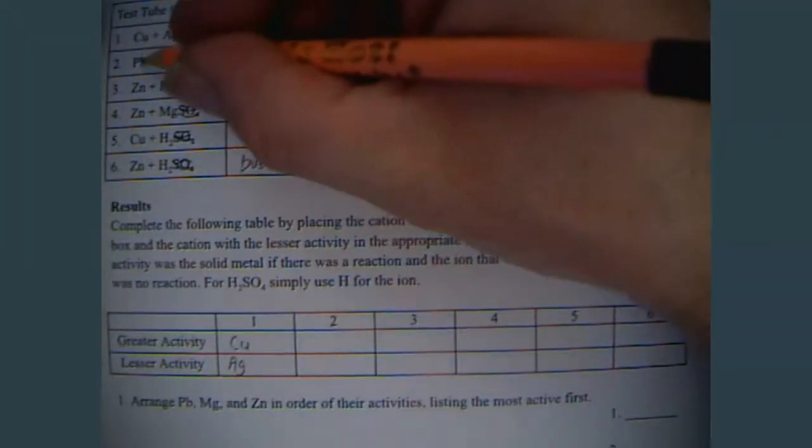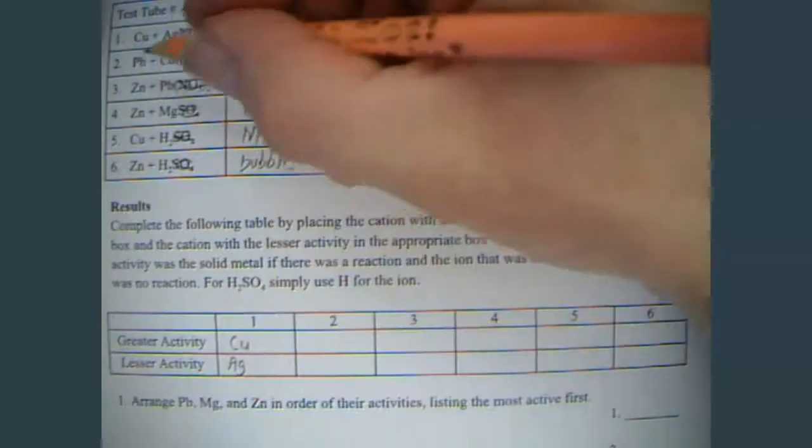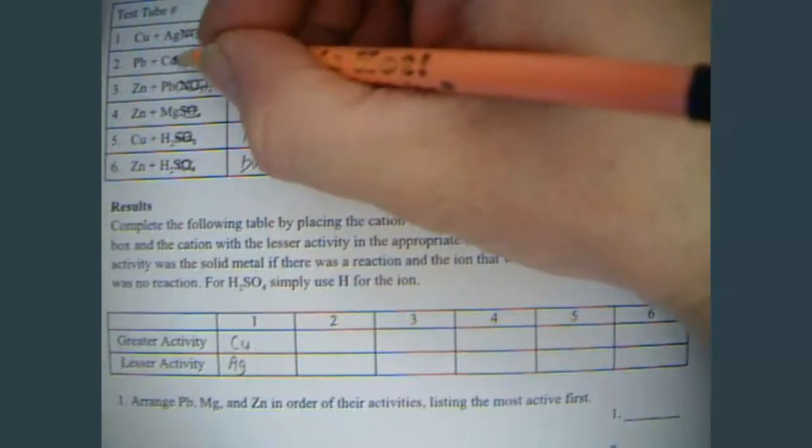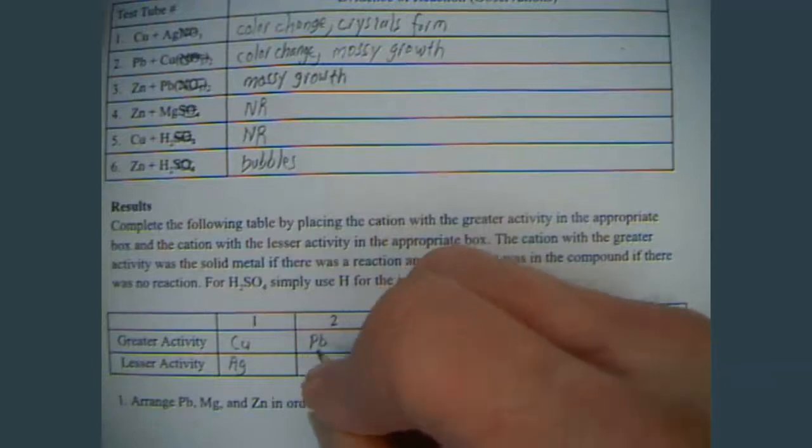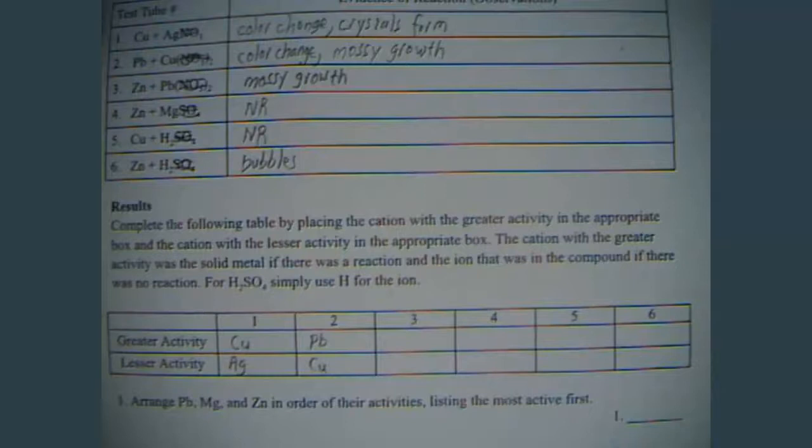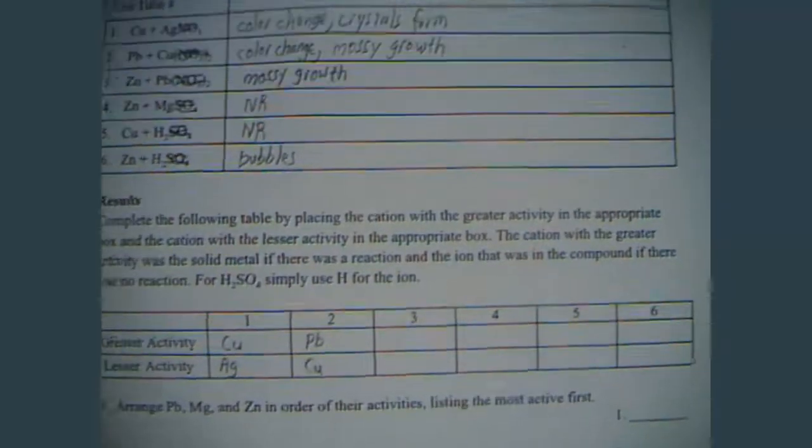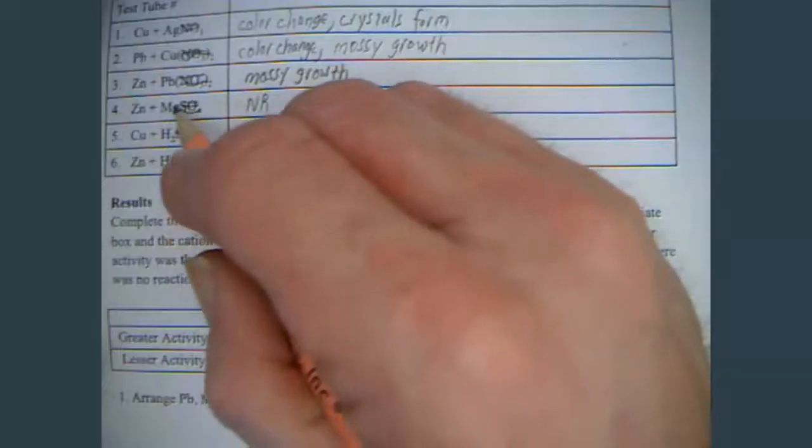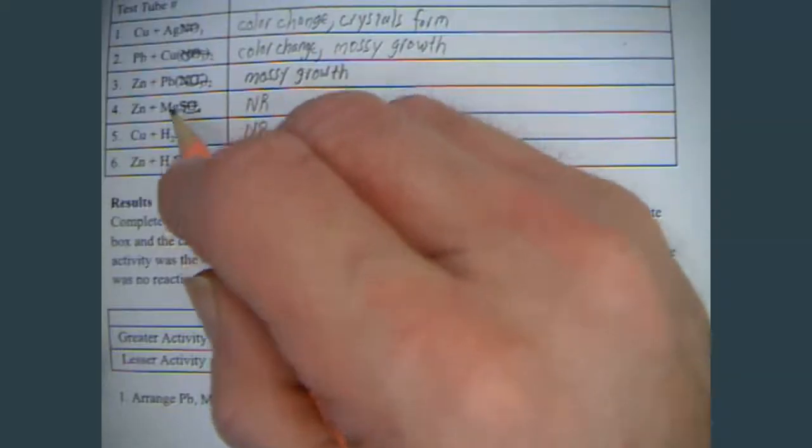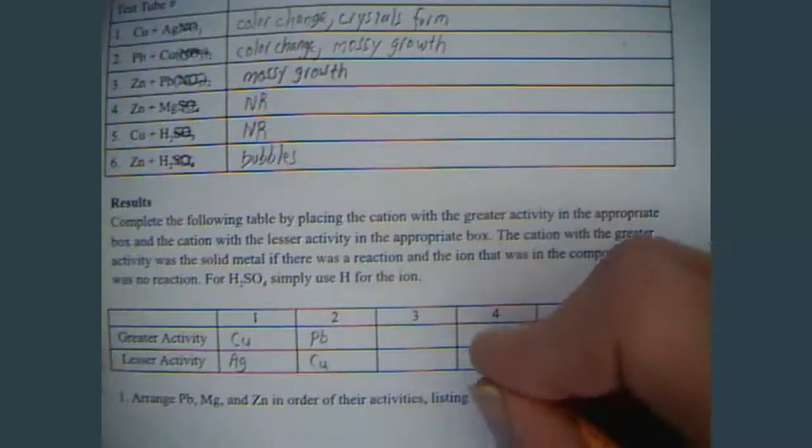Same thing here. If there is a reaction, the solid metal kicks out the aqueous metal, the one that's an ion in solution. If there is no reaction, kind of like I told the joke in chemistry class, I got no reaction. For instance, with this one, the zinc didn't have enough power to come over and kick the magnesium out. Therefore, the magnesium is more reactive.